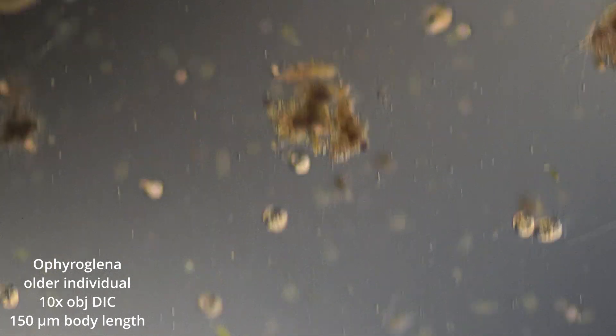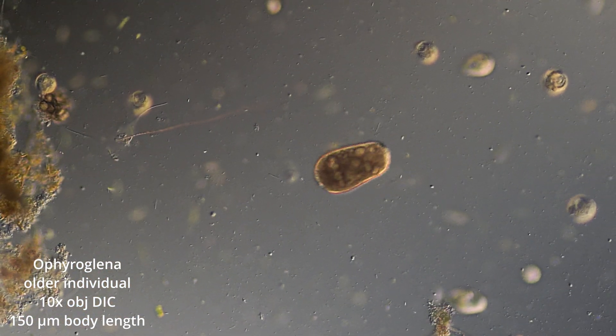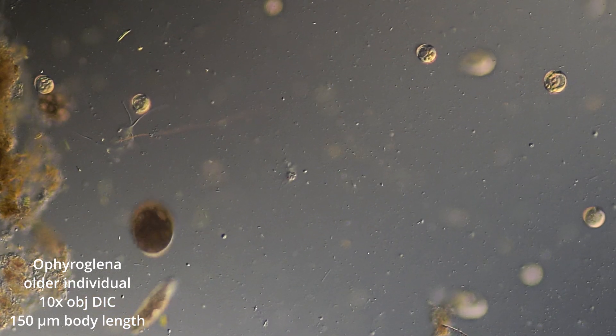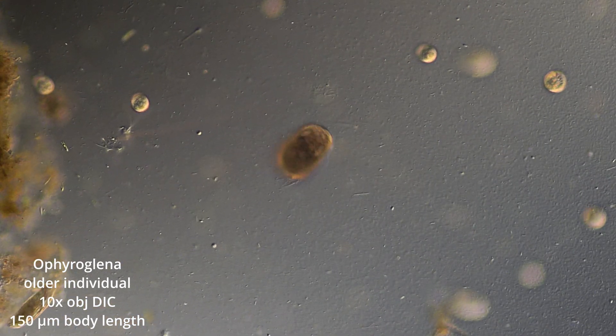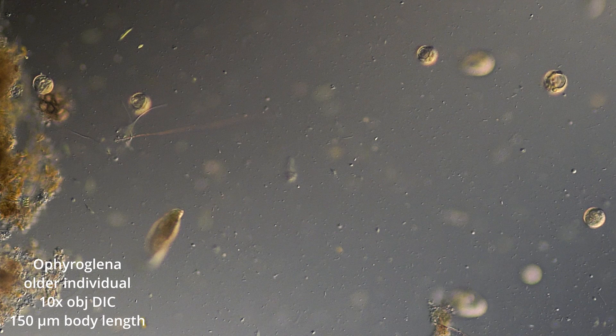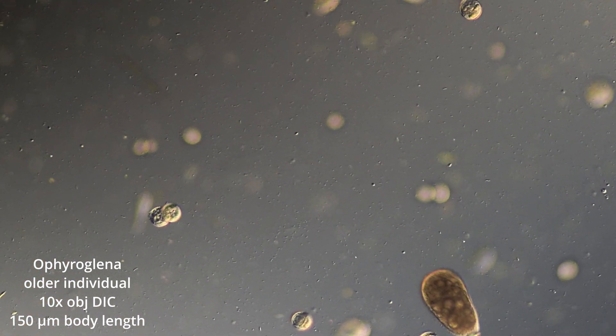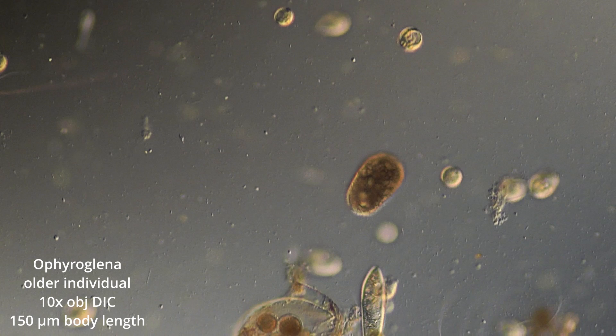Ophira Glena are phototaxic, so they locomote to places of lighter or darker environments. In late-stage, they seek out darker environments, and in early-stage, they seek out brighter environments.